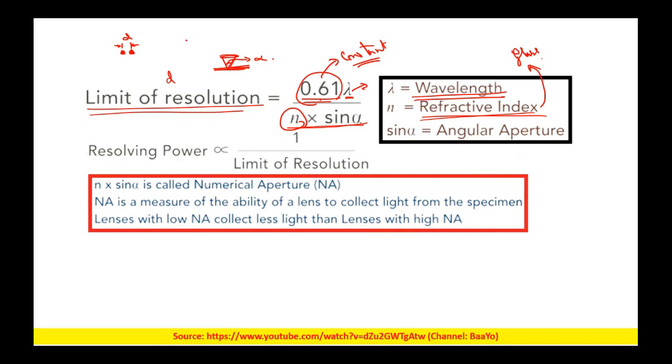So what I mean to say is that suppose over here we have these two points, and we are able to image them properly. Now in the second instance, we bring them closer, and still we can see that there is a gap. So these point objects are being resolved. Then next, again if we move them closer, we are not able to distinguish these two particles or two point objects as separate objects. So we can see there is a limitation at our end. The same thing happens in the case of the optics also.